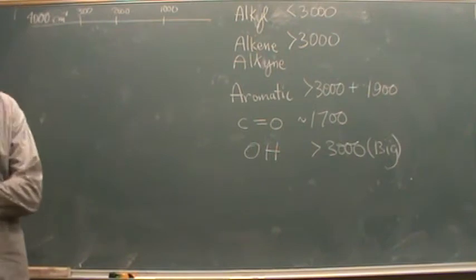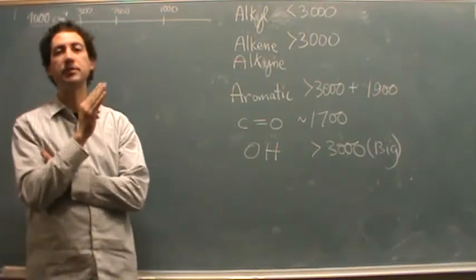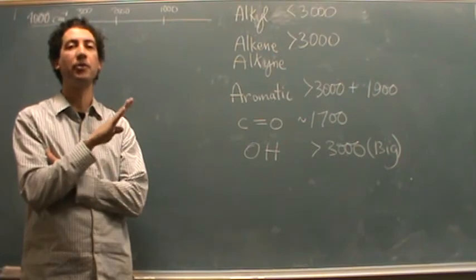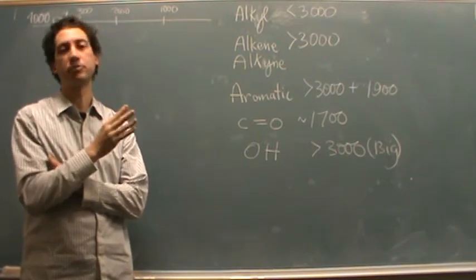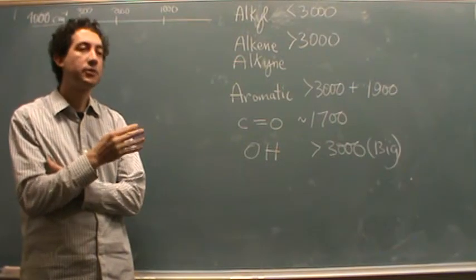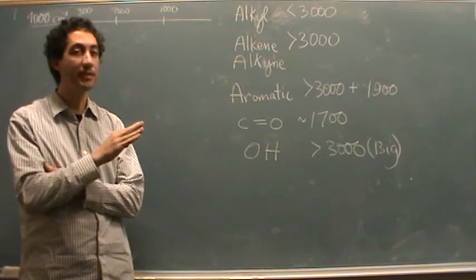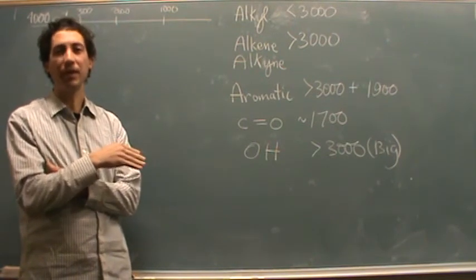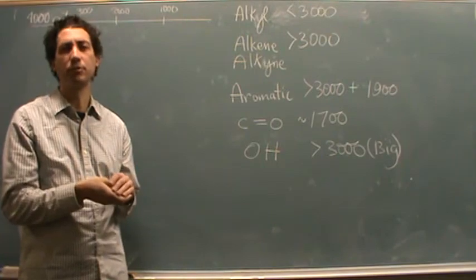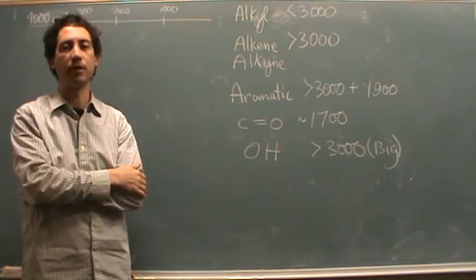Now, depending on what your instructor wants, your instructor may want you to memorize or pretty well know for every single functional group where a peak or a stretching would occur. That's totally fine. If that's it, that's not what I'm showing you. I'm showing you the basics so that you can look at an IR and get the general idea and generally know what functional groups are appearing. And that's the best that IR can do. It shows you what the functional groups are.